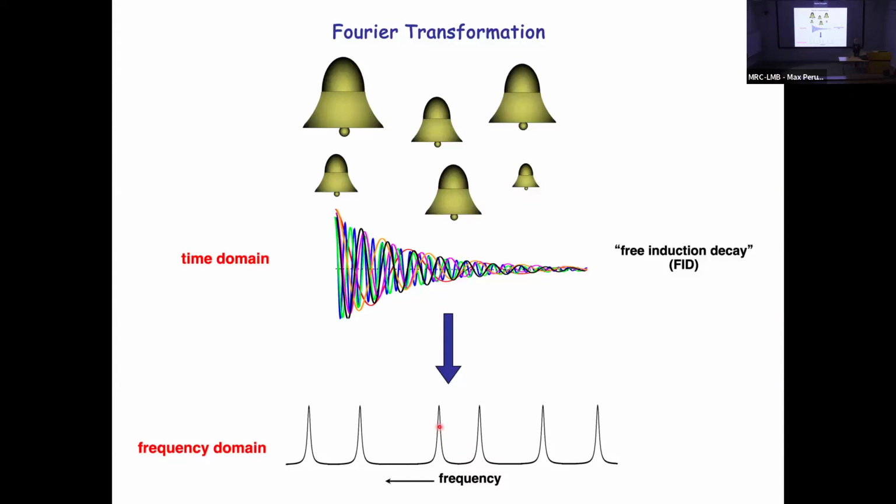So we use the radio frequency equivalent of white light, broadband polychromatic excitation pulses across the resonant frequency range of the NMR spectrometer, and we excite all of the spins simultaneously. We record this cacophony that comes off and run it through a Fourier transform to extract all the frequency components. It's a nice analogy.